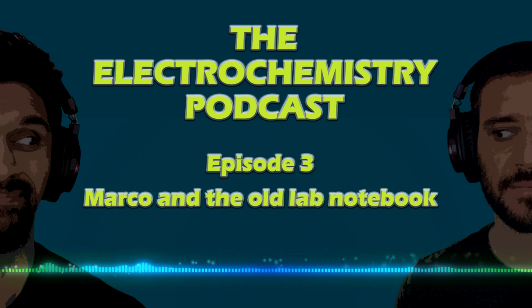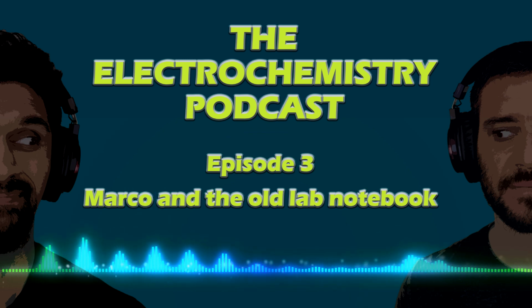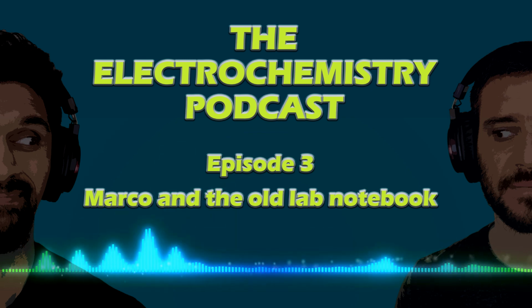On today's podcast, we are going to take a look at Marco, who is a graduate student doing some amazing synthesis work developing novel nickel-based heterogeneous catalysts. Marco has spent most of his research career doing synthesis. Whether it was organic synthesis or inorganic synthesis, Marco could be found in the lab running columns or running to the NMR. He could run a mass spec, but when it came to potentiostats, Marco was out of his element.